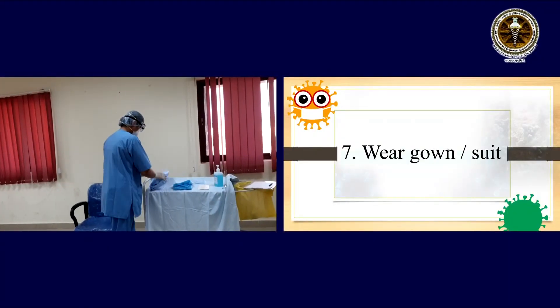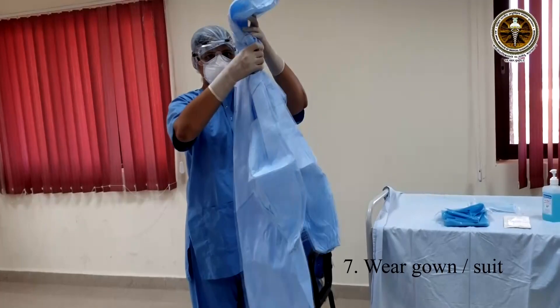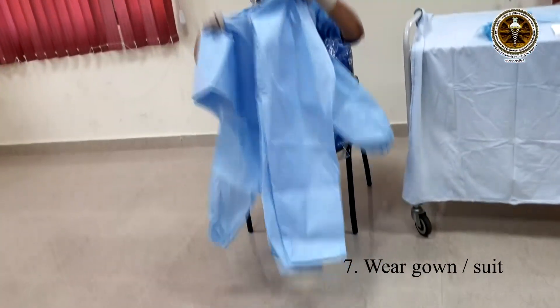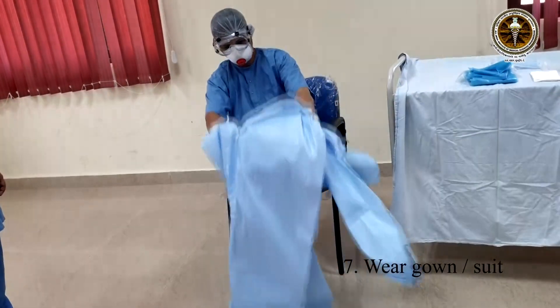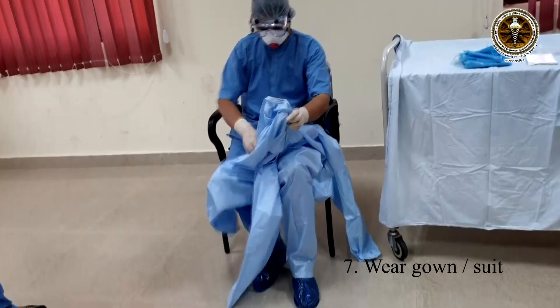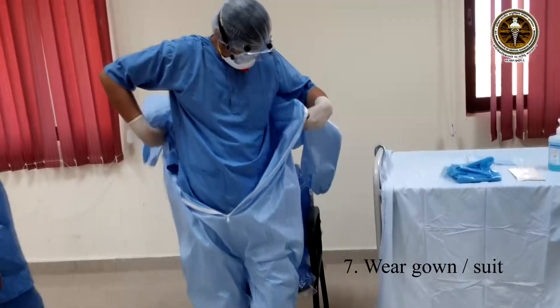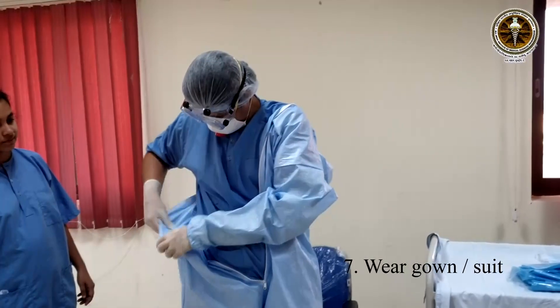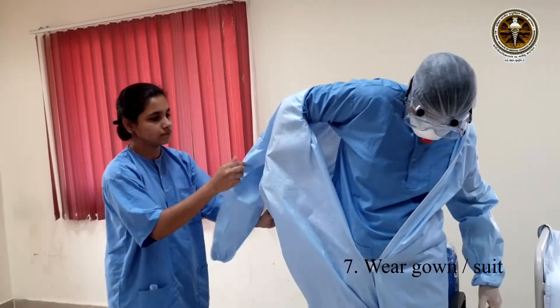Next, wear the gown or suit. Some PPE kits may be provided with a gown. The buddy helps to ensure that the gown or the suit is worn properly. The wristbands of the gown can be tied or taped to the first pair of gloves. Check for mobility. Wear the apron if it is provided in the kit. The apron can be tied in the front for easy removal during doffing.